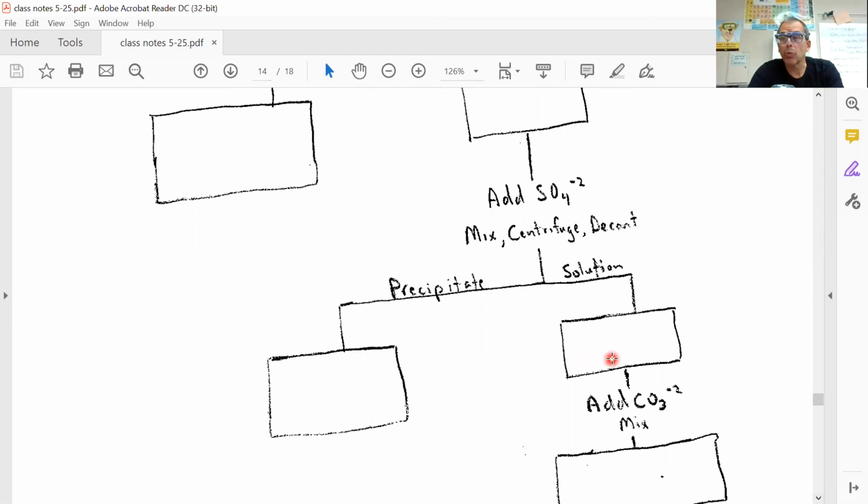And then the last one is CO3, and that should get cloudy. Notice it might not give a huge amount of precipitate that sinks to the bottom, but it gets cloudy right as I add the drops. That's what I look for initially. Is it getting cloudy when I add the drops? If so, that would be a yes there. So we got a yes for all 4 precipitates, which is expected because I put all 4 in there. And that would be the positive test you'd look for in an unknown, whether you have those things happening or not.